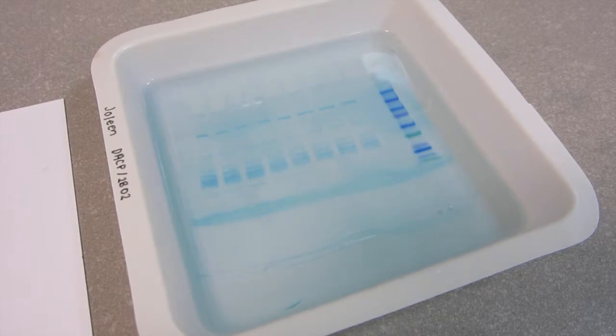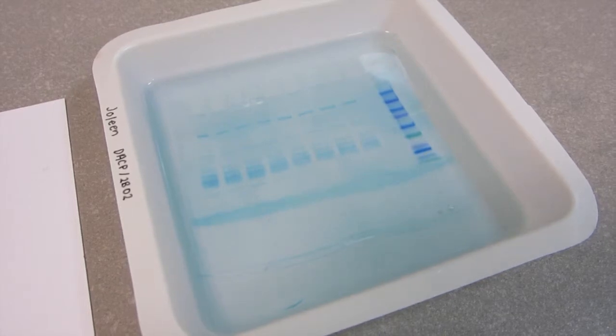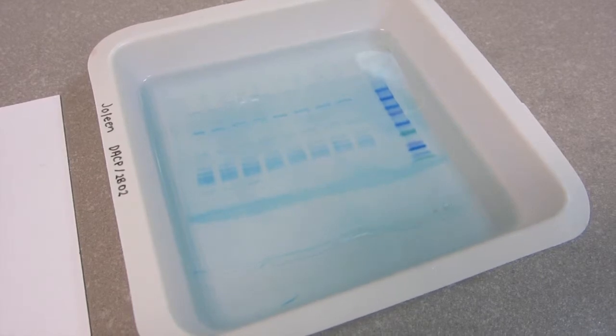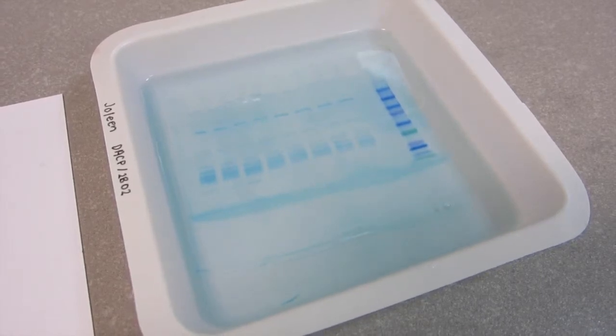The molecular weight of the protein samples can then be determined from the calibration graph of the molecular weights against retention factors of the standard.